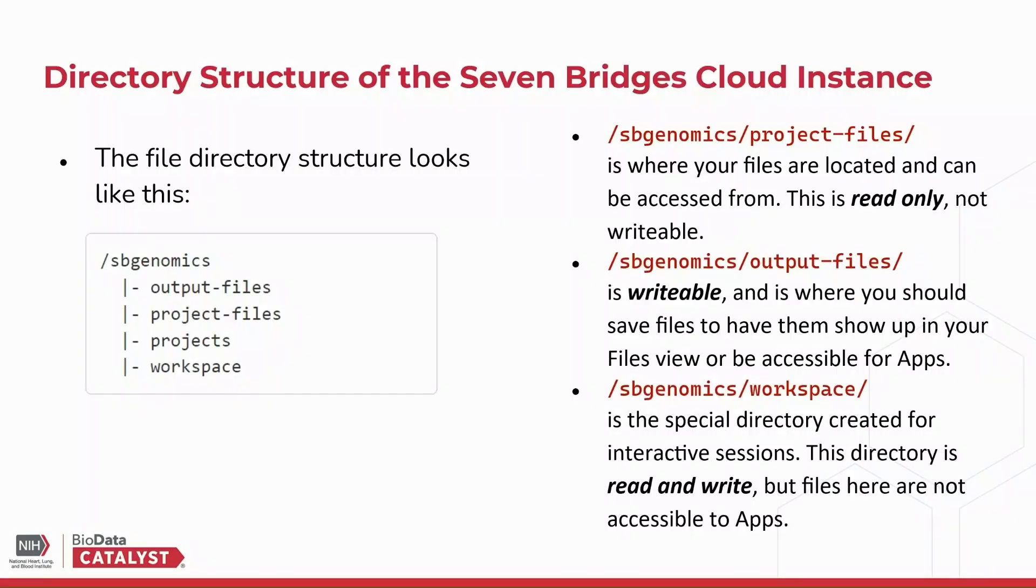Before we begin, I'm going to explain the directory structure of the Seven Bridges Cloud instance inside a Data Studio session. The file structure looks like this: /sbgenomics is the root directory for the instance, and it has subdirectories output-files, project-files, and workspace.